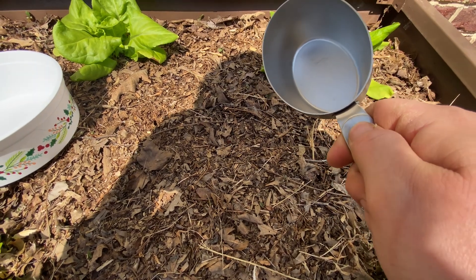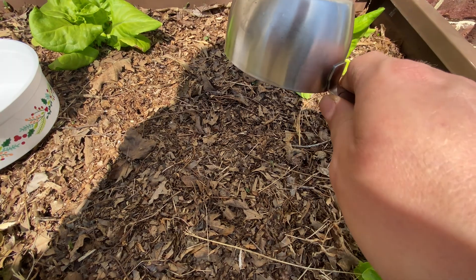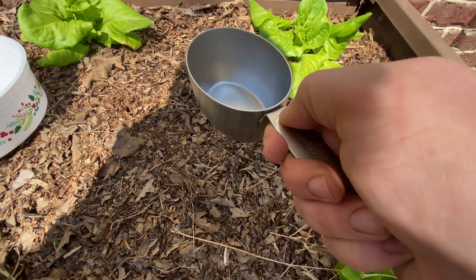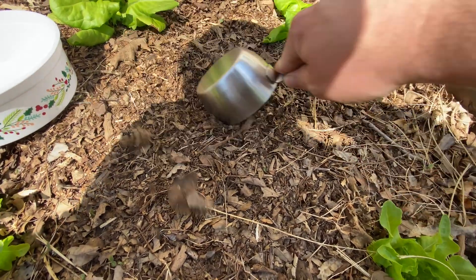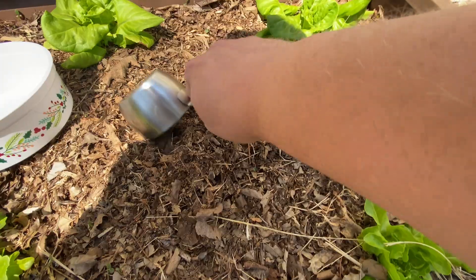We're going to collect a sample for the RapidTest soil test. They say not to touch the soil with your hands, so we're going to try not to do that. I need one cup and then just a little bit more for the pH test. So I'm just going to scrape my mulch aside here and get down to the soil.